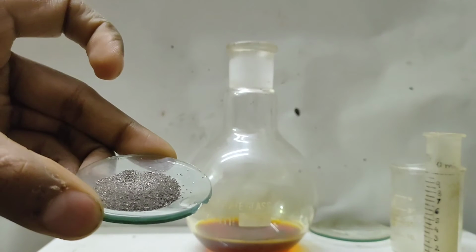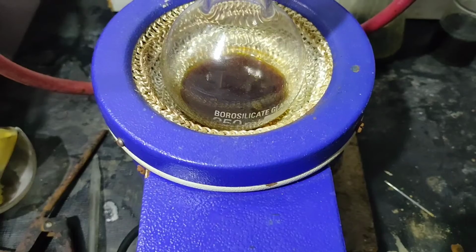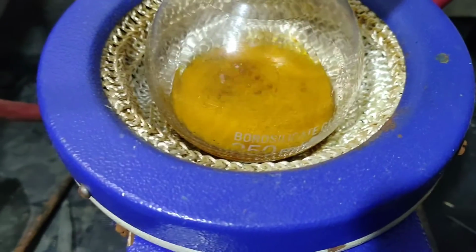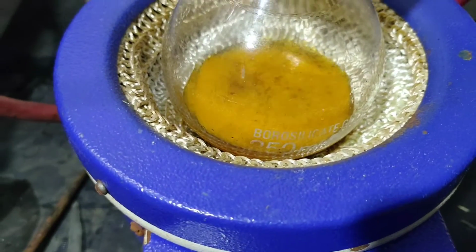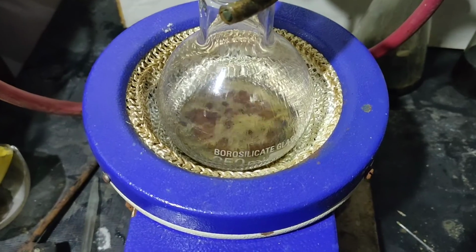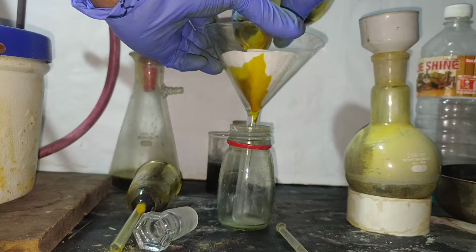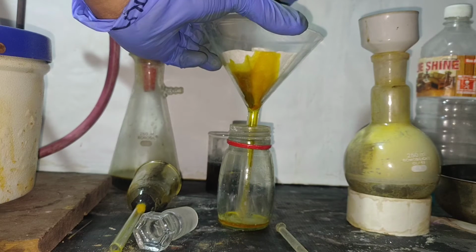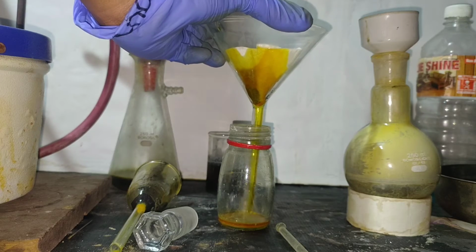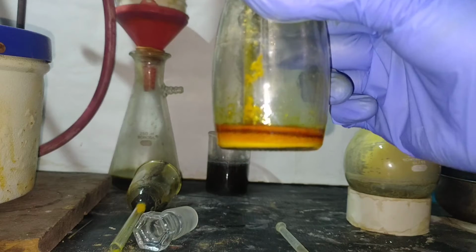So I added 3 grams of Devarda's alloy powder into the reaction mixture. Now the reaction runs smoothly on heating, and after a few minutes the reaction mixture looks like mango juice. After 1 hour the foam looked colorless, which means our reaction is complete. The reaction mixture was filtered hot, but due to aerial oxidation, the solution again started turning red.